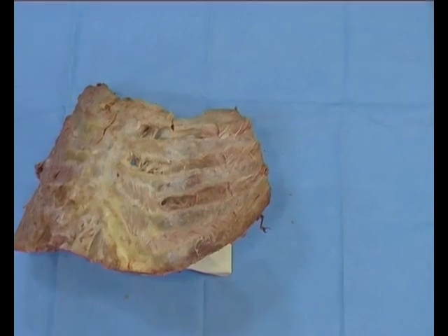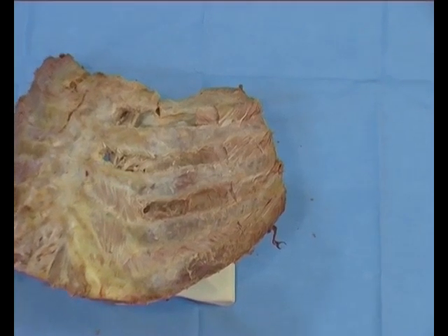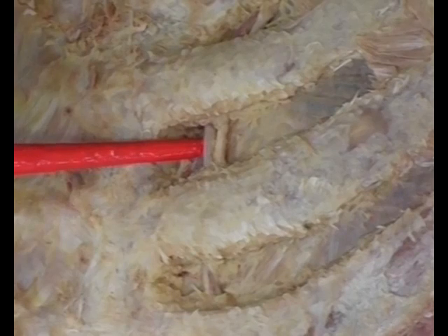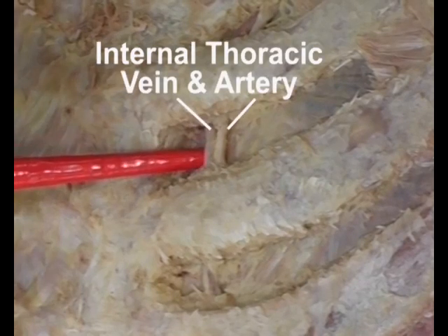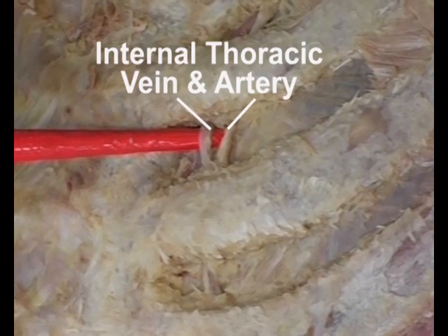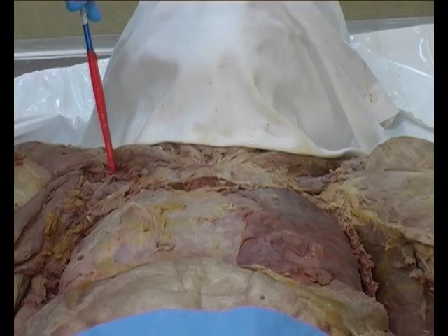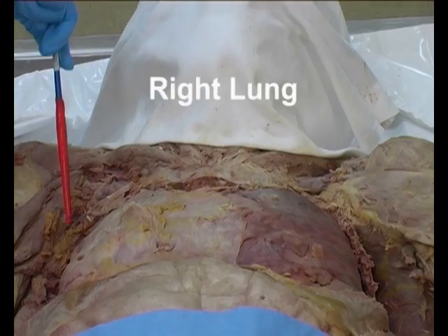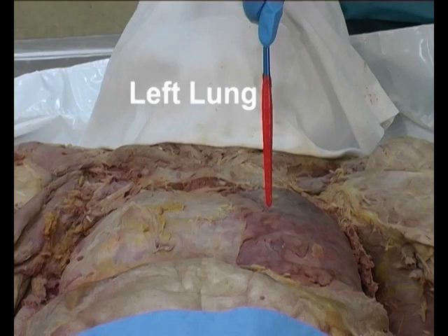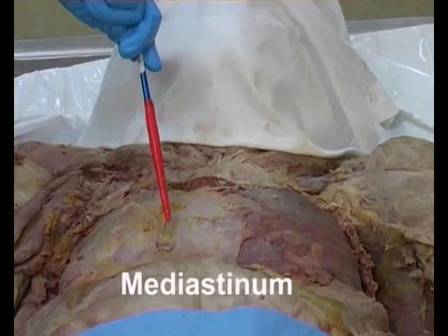Cut a window through the intercostal muscles, just lateral to the sternum, in the first intercostal space. Identify and transect the internal thoracic artery and the internal thoracic vein transversely in the first intercostal space on both sides of the sternum. Identify the following structures: the right lung, the left lung, the parietal pleura, the mediastinum.